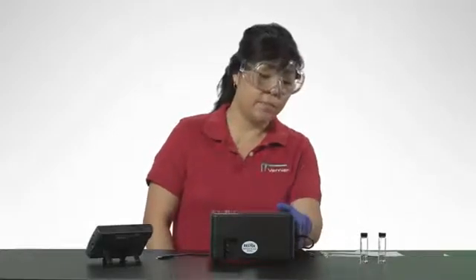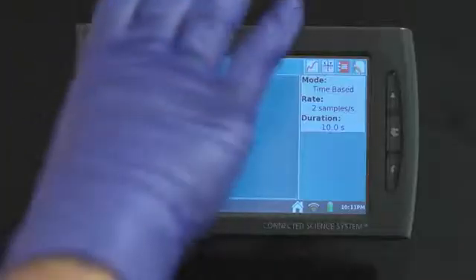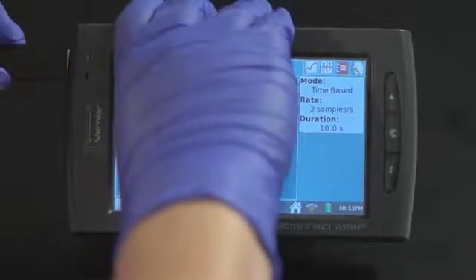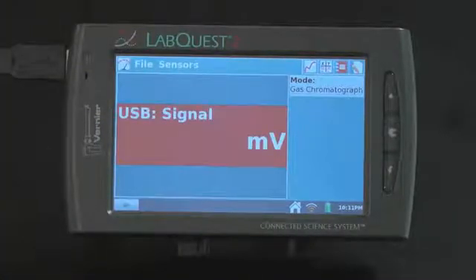Prepare the Mini-GC Plus for data collection. Connect the Mini-GC Plus to an electrical outlet. Turn on the Mini-GC using the on-off switch located on the left side. Connect the USB cable to the USB port of LabQuest. LabQuest will auto-ID the Mini-GC Plus.